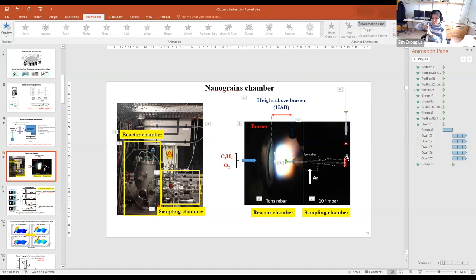Then its influence on the particle will collide. Then its influence on the structure of soot. And also when we bring the sample to ambient air condition, due to the pressure, there is an influence on the sample. That is what I see from the soot produced in low pressure flame. For the mini cast soot, that is the soot produced in atmospheric condition, I don't see the sampling process influence on this type of soot particle.